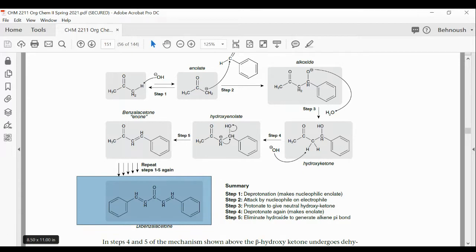And to identify the product and for the quantitative analysis, the numbers that you need, there would be 1 for percent yield. Acetone is the limiting reactant here. The limiting reactant to product is a 1-to-1 ratio.